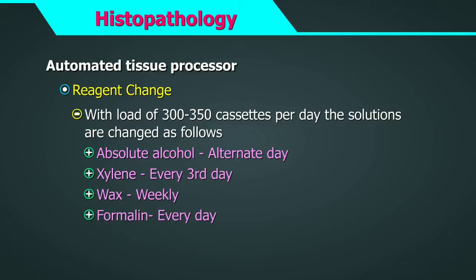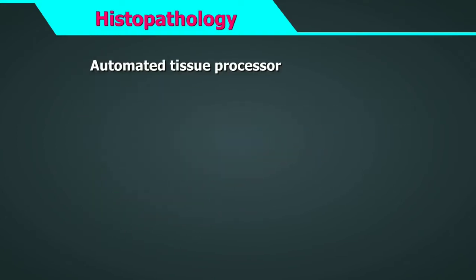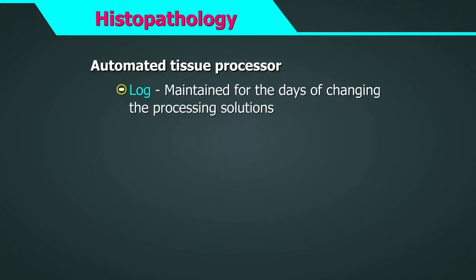It shall be the responsibility of the technician in charge to maintain the correct concentration and levels of the processing solutions. A log shall be created and maintained by the technician for the days of changing the processing solutions.